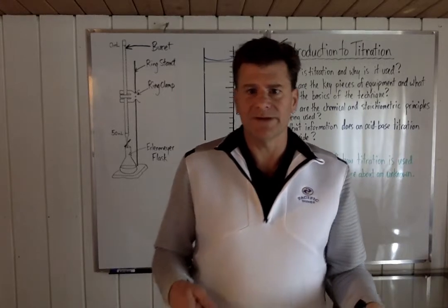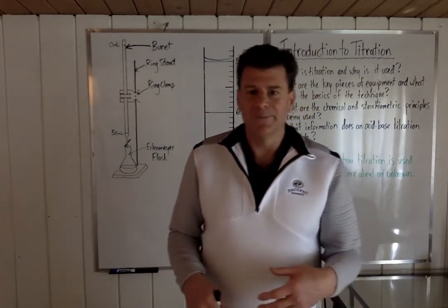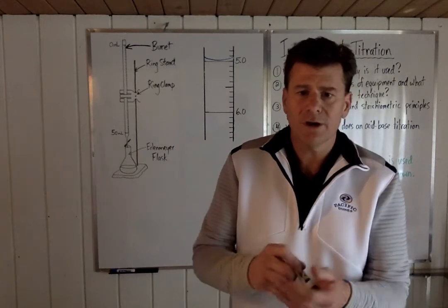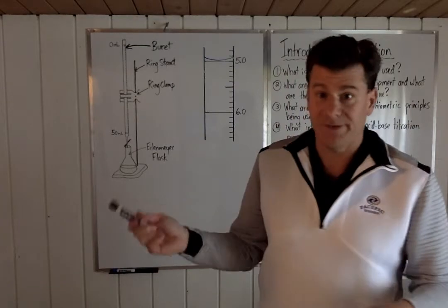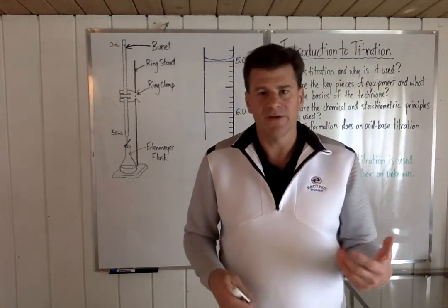When you're in Chem 11, you never did a titration. Well, you probably saw the stuff out for the Chemistry 12 people for the next class or something. So you probably have seen the things. So what are the basic pieces of equipment? I've drawn a picture up here on the board. So over here, I've drawn as best I possibly can the setup of a titration.